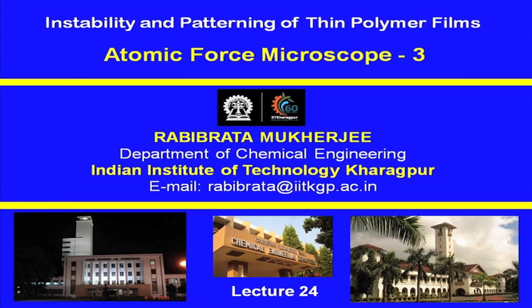Welcome back. We will continue discussing the atomic force microscope. We just got introduced to the concept of an AFM in the last couple of lectures. So, today we will do a quick recap of the major hardware components which we have already talked about, and then we will move on to the basic working principle of an AFM. Of course, one needs to understand, as I have already pointed out, that it is a relatively new instrument. So, there is a lot of development that is still coming up in this area.